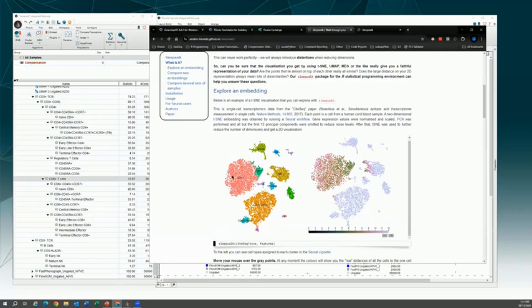On this side here, we have the UMAP overlaid with the clusters. And then on the right is the Sleepwalk tool. Basically, when I hover my mouse pointer on a point, there's a scale across the bottom. Where my pointer is, the color scale when I hover is the distances calculated from all these events in high dimensional space, but shown on 2 dimensions here.